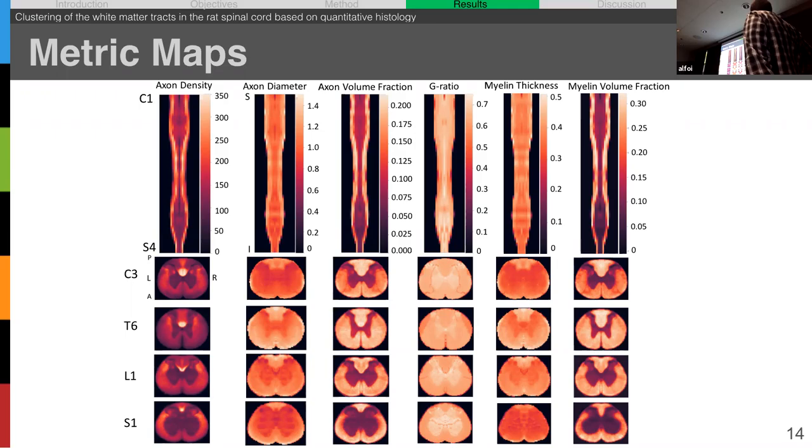As well as for staining, it would be the osmium penetration, which could overstain or stain really deep and damage samples because it's a heavy metal. So it could just be a pileup of osmium right there. Yeah. Maybe it just likes the center of the specimen. It's possible, yeah. What about the small?